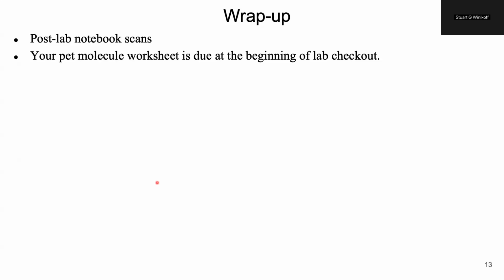So wrap up for this one is mostly make sure you do your post-lab scans. This means you should be writing everything in your notebook as you go and fill out your pet molecule worksheet so that you can do it at the beginning of lab checkout.